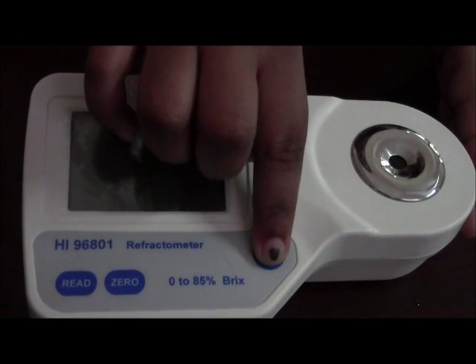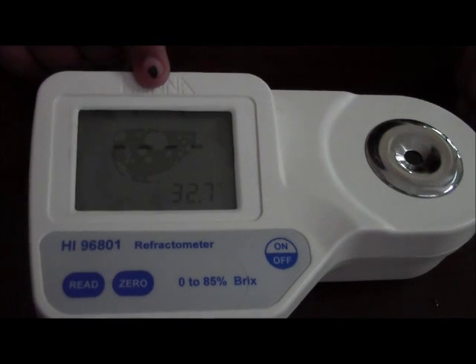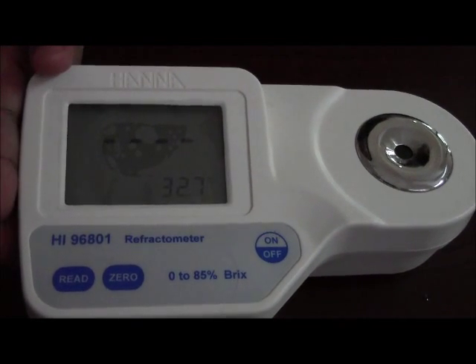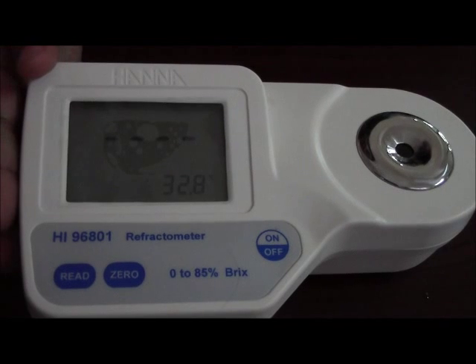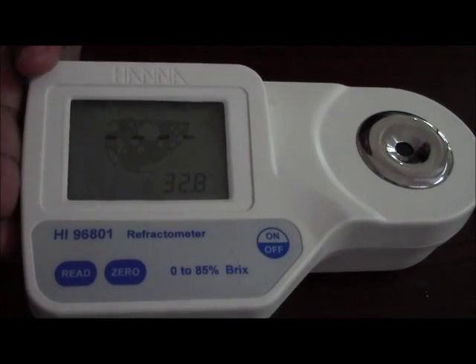We would now switch on the meter. It shows 100% battery. There is a BEPS system in the meter, which is your Battery Error Prevention System. It will tell you the status of your battery.